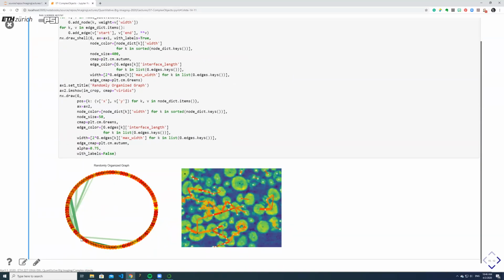Now we can see a little bit more how some are more connected than others. So for example, in these crazy areas, there is a lot happening. In other cases, we only have one or two connected regions. And in this graph, if all were connected to all, that would be filled in here.